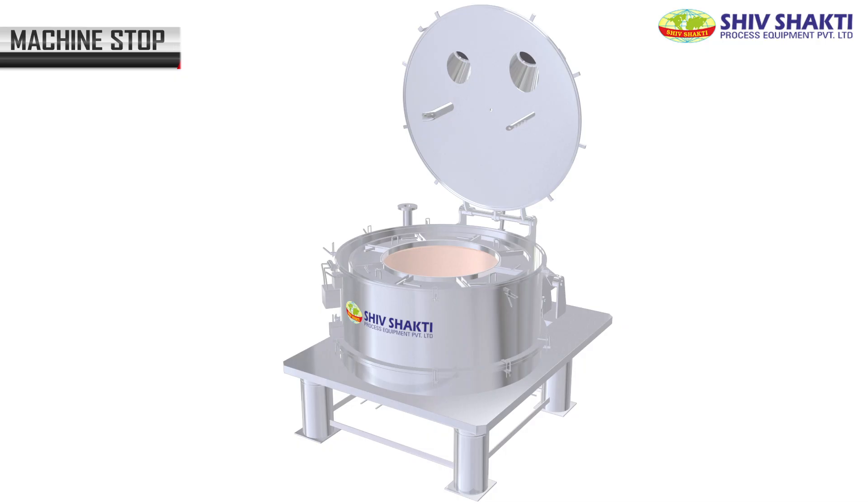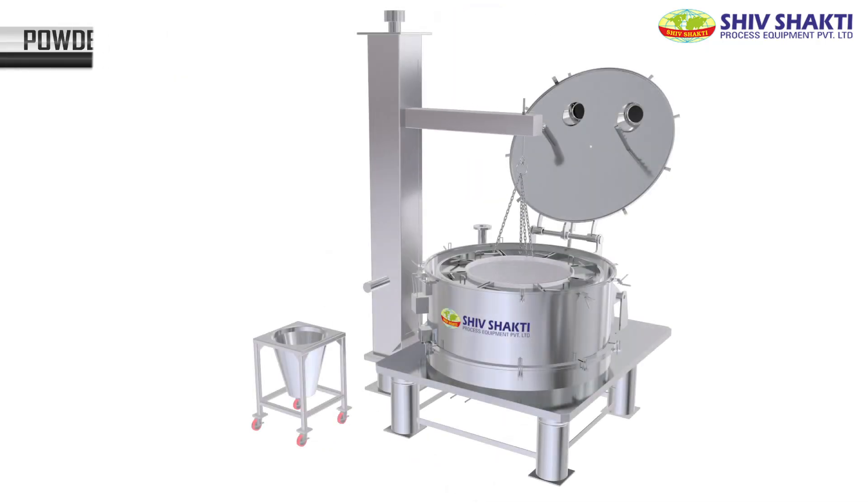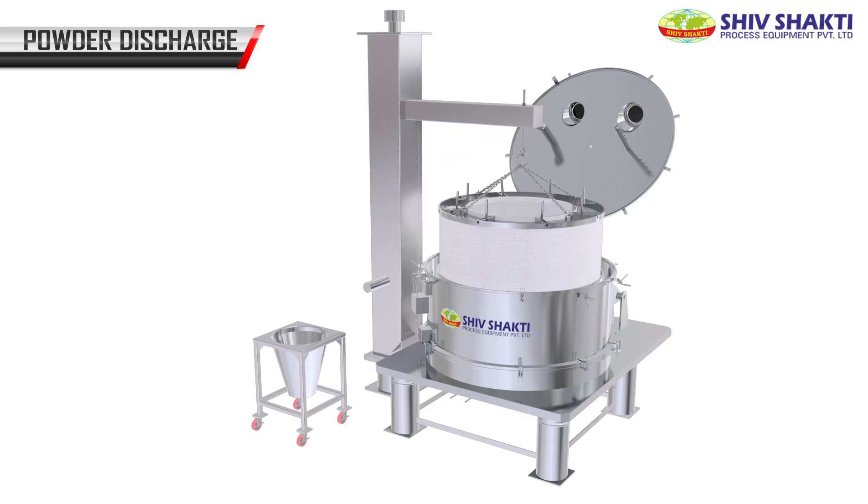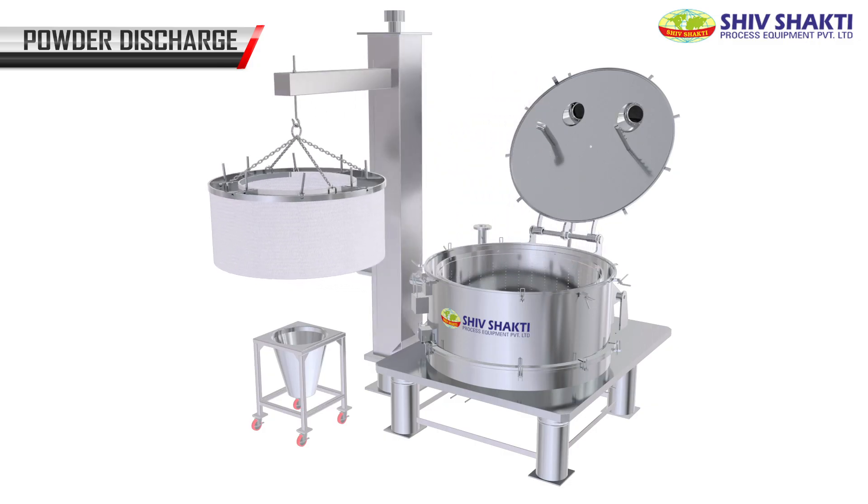The machine stops. The basket lock opens and, with a lifter, it lifts the bag and the powder is discharged into the hopper.